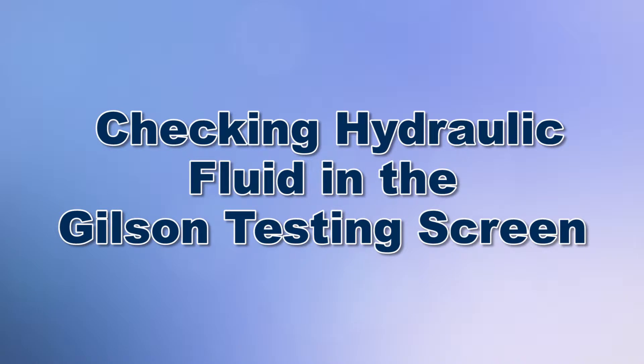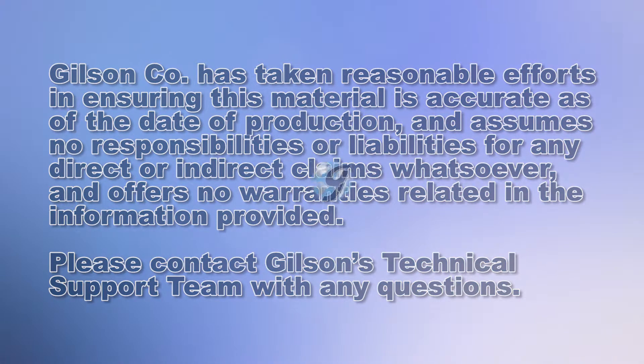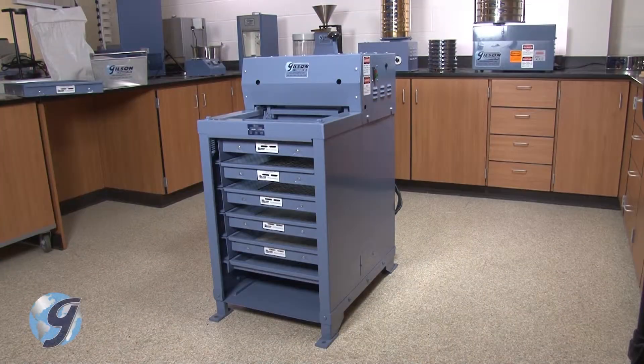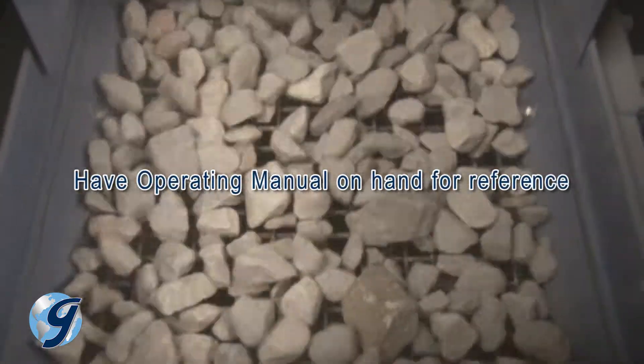Today we're going to check the hydraulic oil level on your Gilson testing screen. The Gilson testing screens are rugged, tough machines that will provide years of service if installed and maintained correctly.